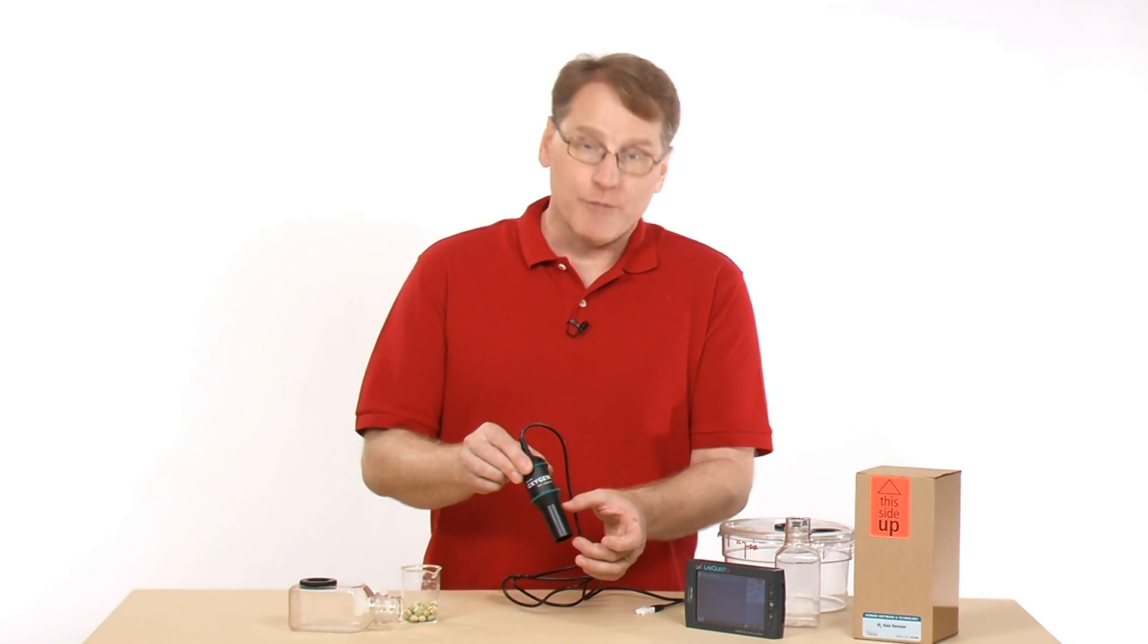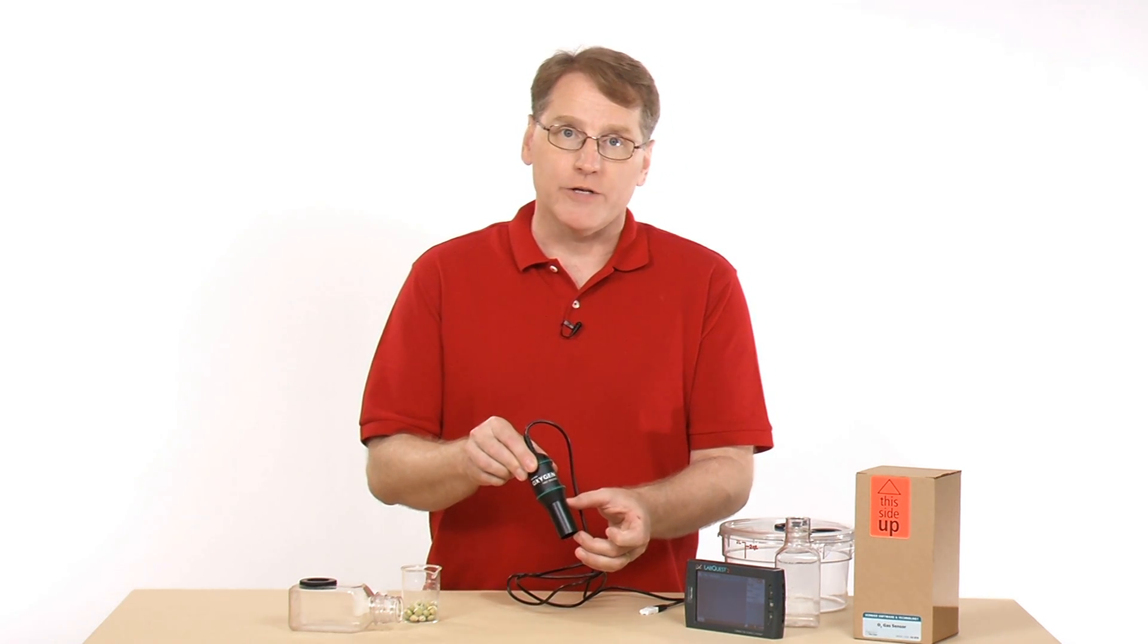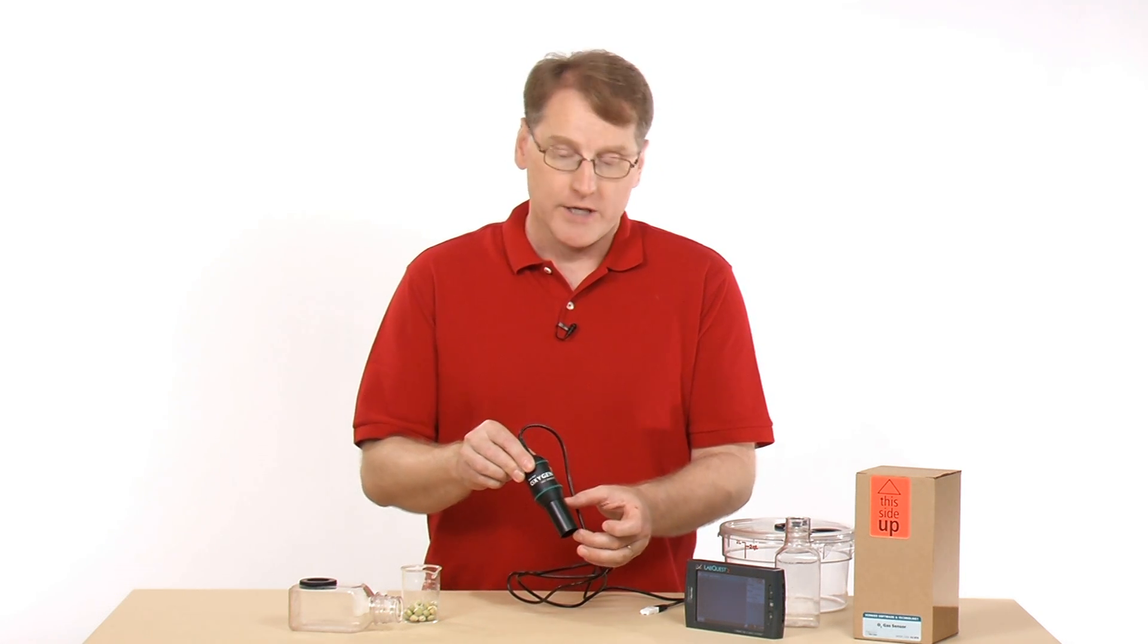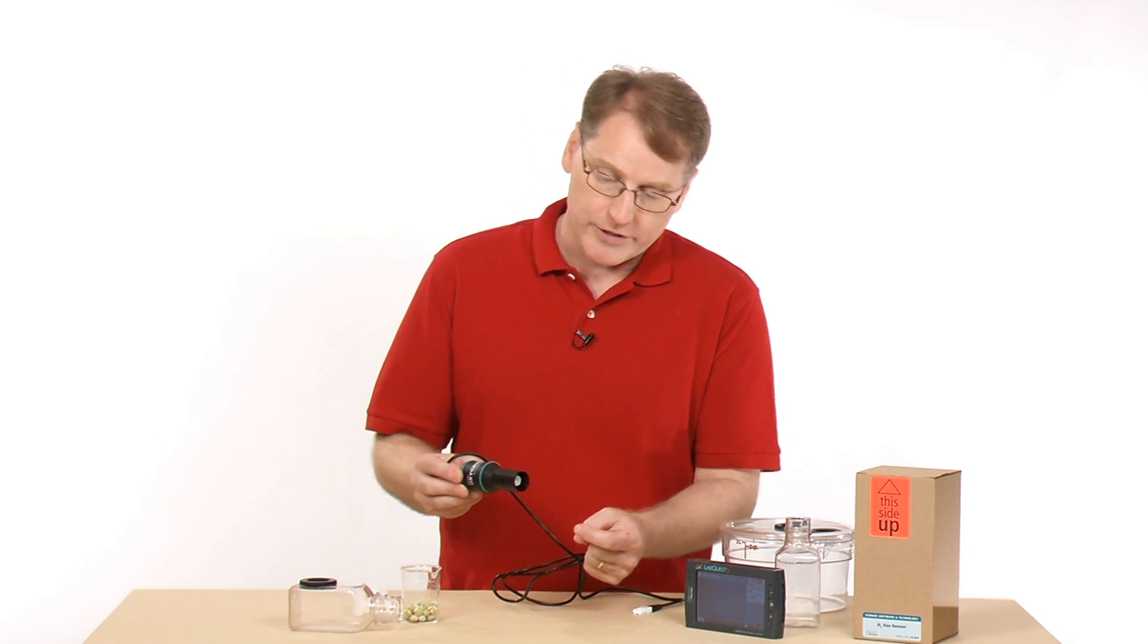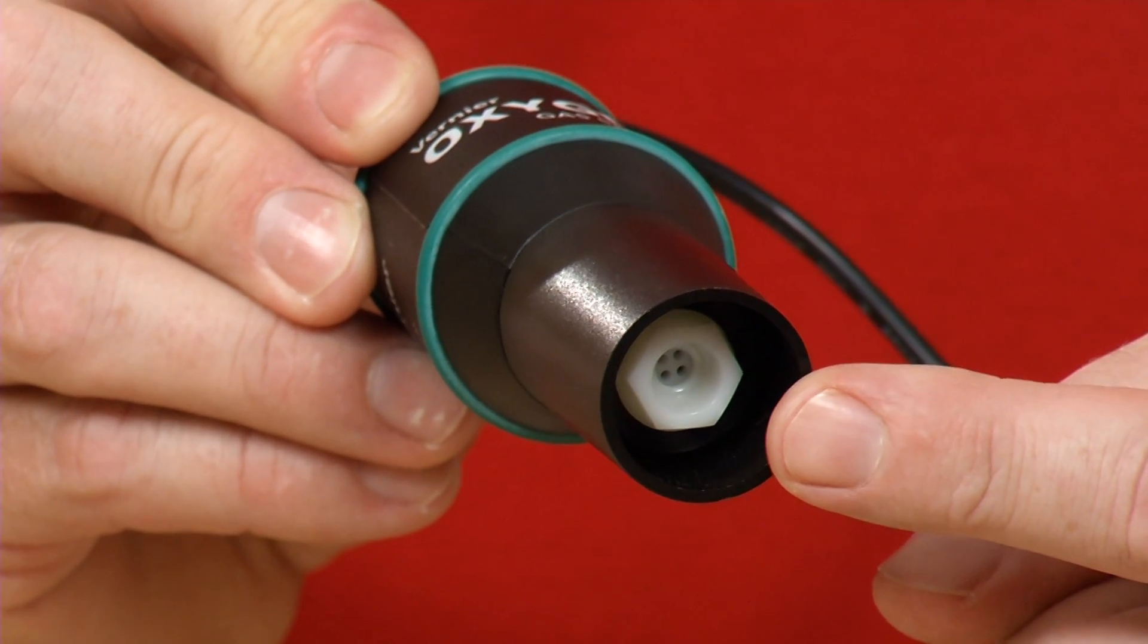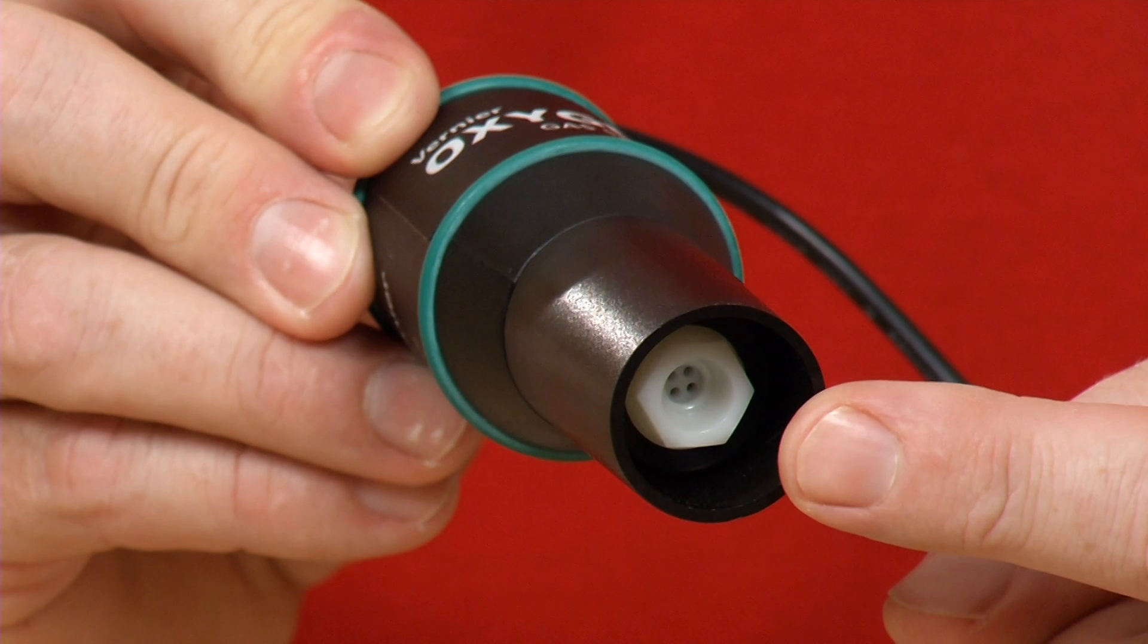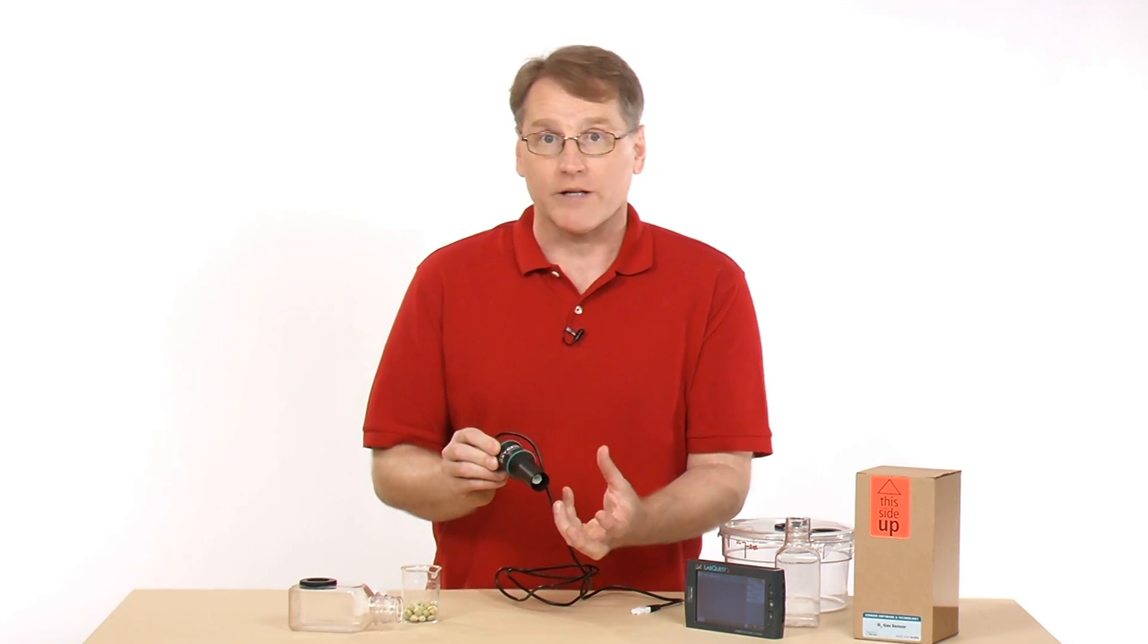it is a chemical half cell, and it measures the concentration 0 to 27% of oxygen. And the oxygen has to go through a membrane here at the bottom. So it diffuses through there, and it can measure that concentration.